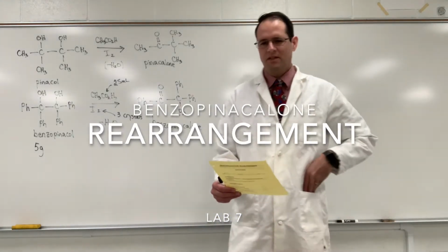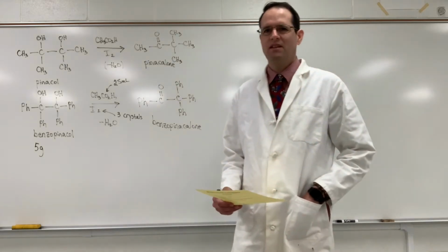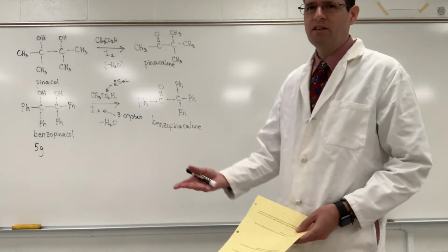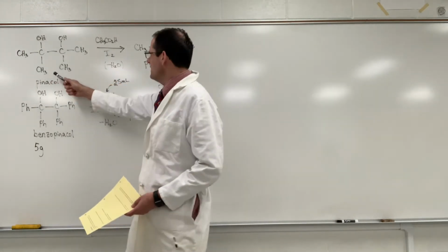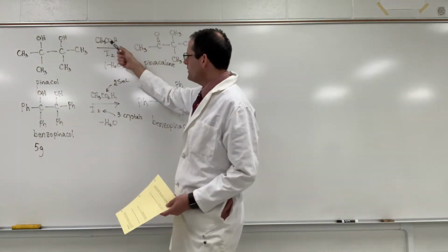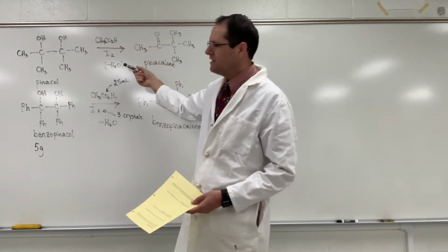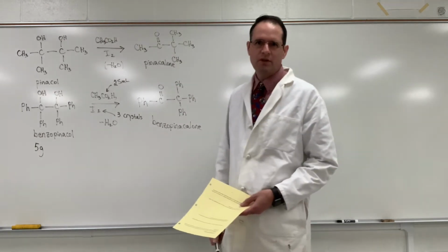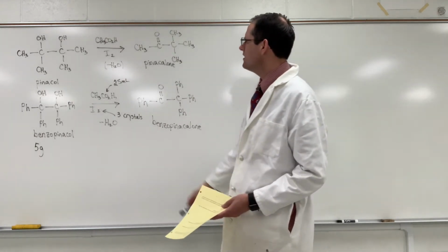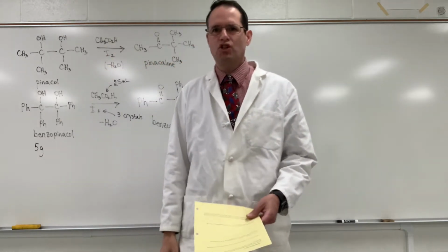Hello and welcome. This is Lab 7, the benzopinacolone rearrangement, and let me explain a little bit about it before I take you through the procedure and get the results. This is pinacol, and under refluxing acetic acid conditions with a crystal or two of iodine, water is lost and you form pinacolone, so it's a rearrangement, okay? Water is lost and you form a ketone from a vicinal diol.